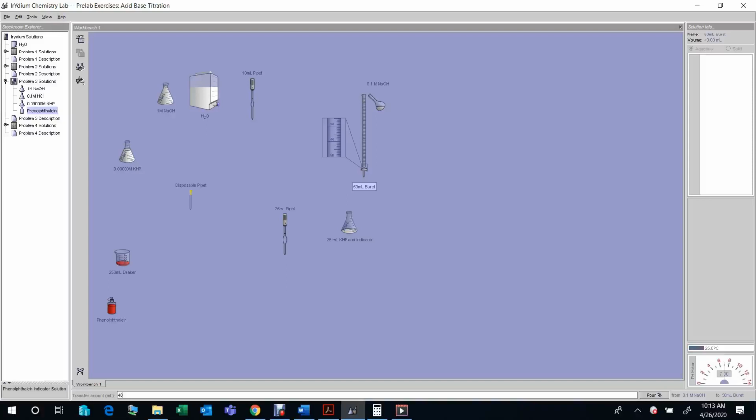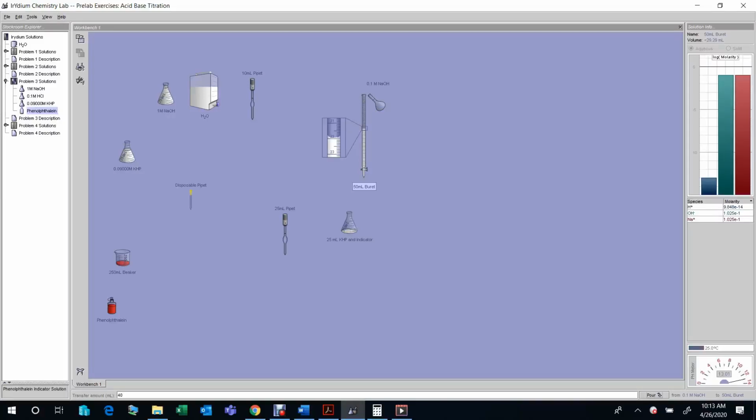And then when we want to calculate the amount, we use the difference before and after adding solution. So the starting pouring level is 50 here, and then we can do the pour. You see, the reading is nearly 22. Then we can do the calculation.